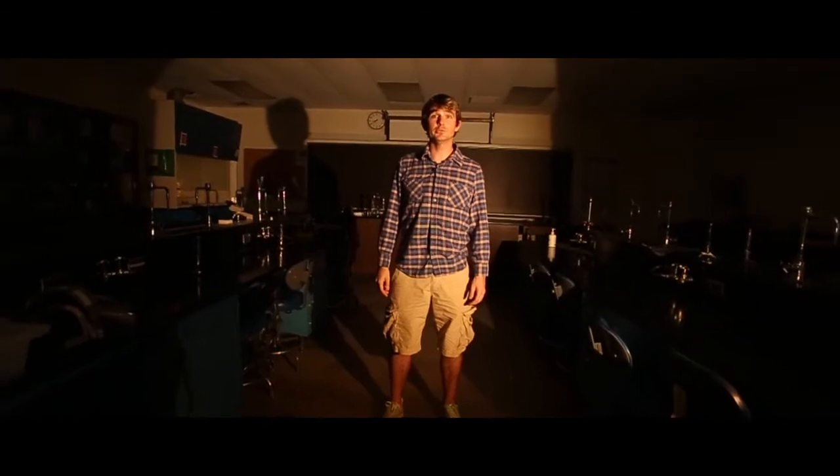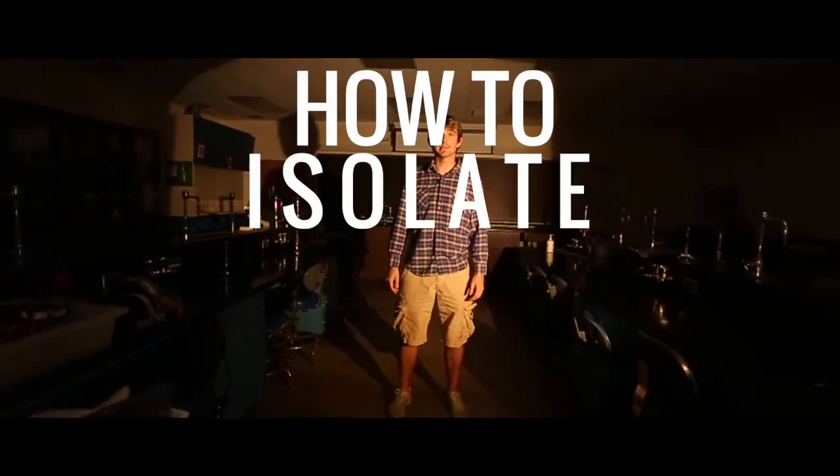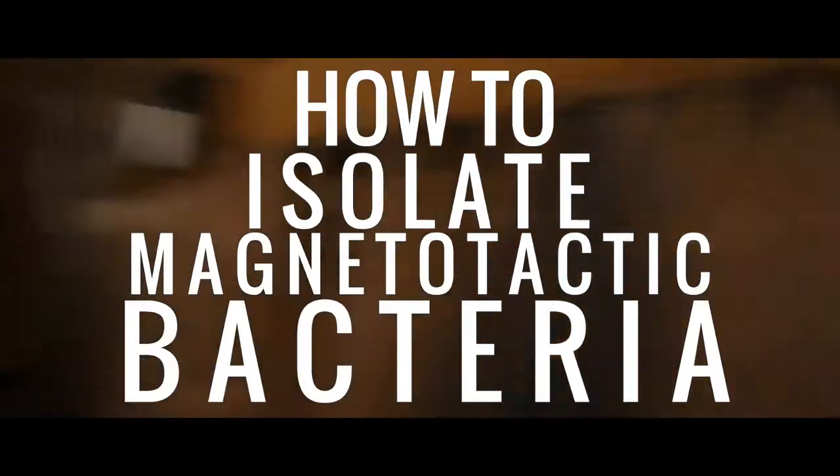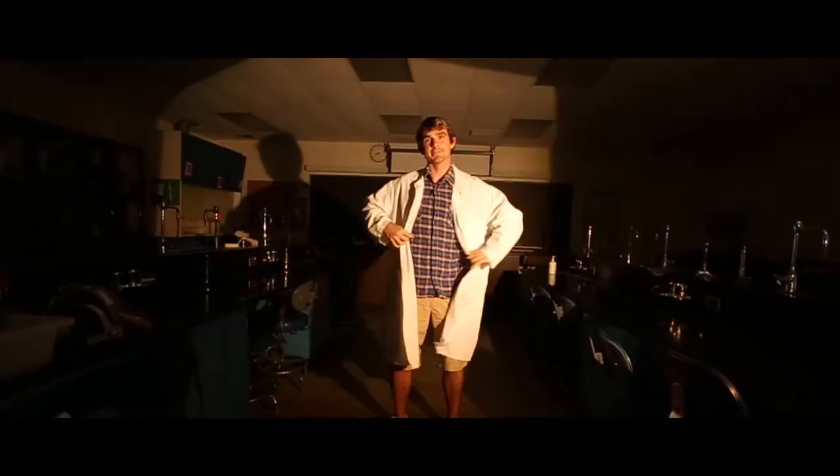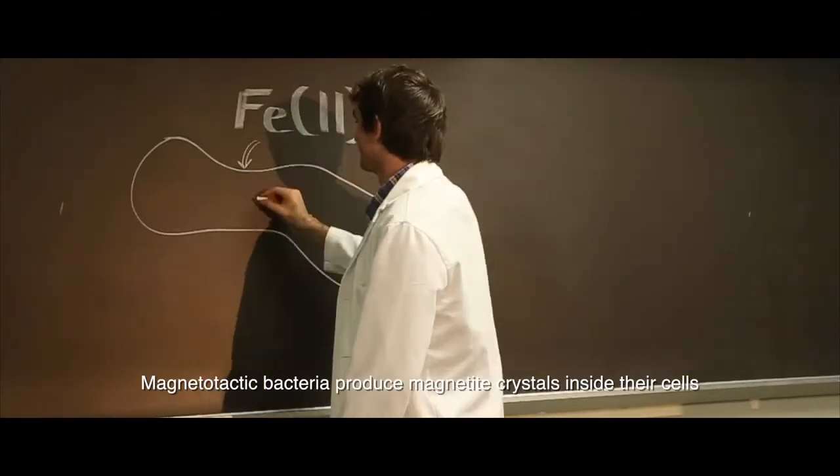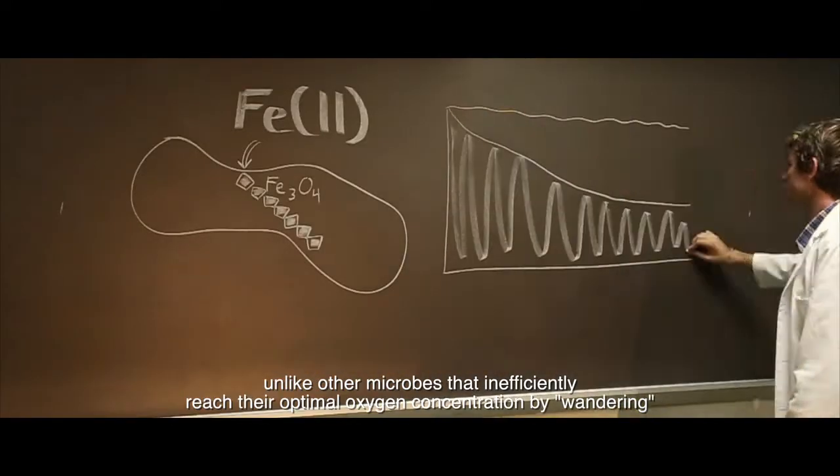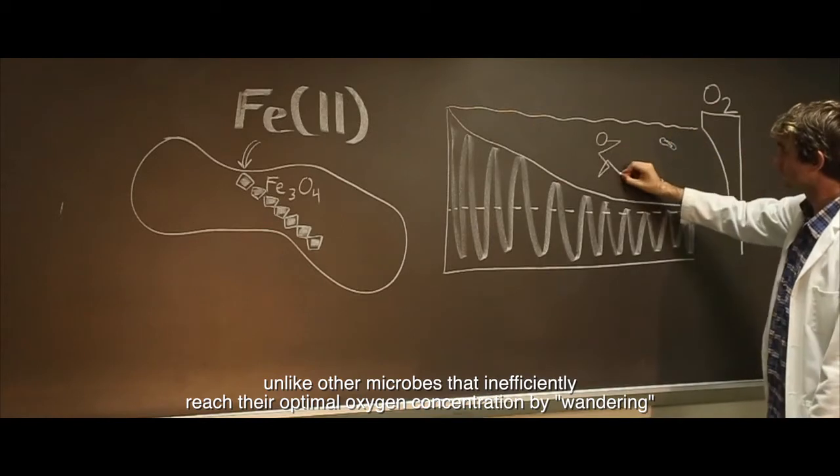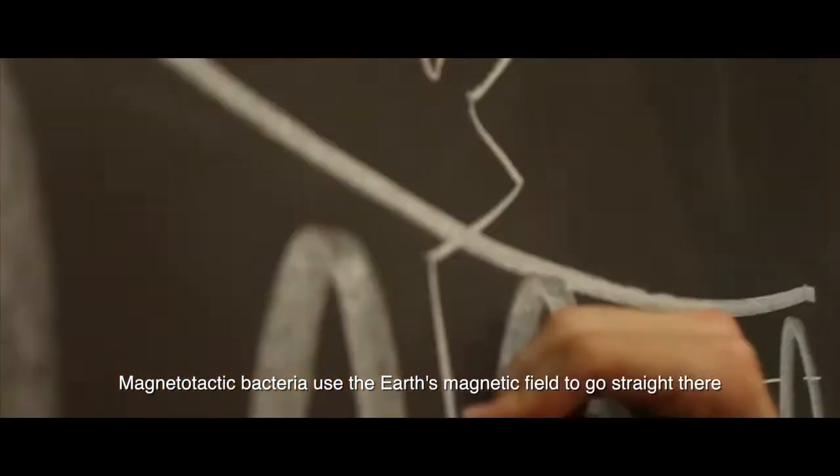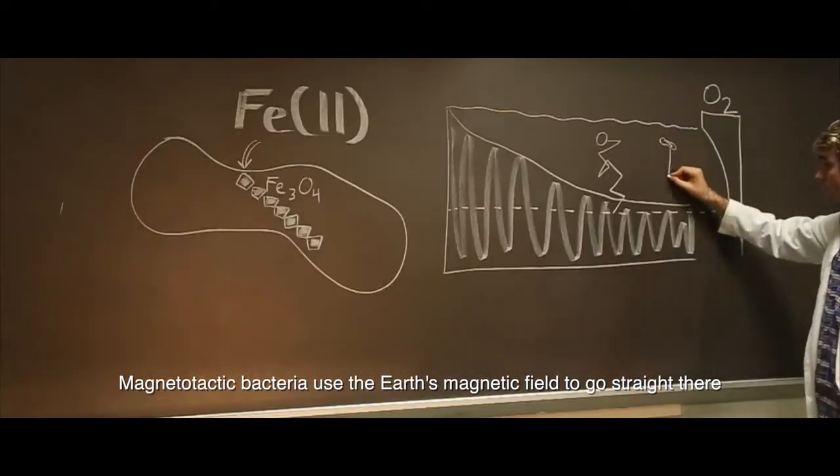Today I'll be taking you through some techniques on how to isolate magnetotactic bacteria. Magnetotactic bacteria produce magnetite crystals inside their cells. Unlike other microbes that inefficiently reach their optimal O2 concentration by wandering, magnetotactic bacteria use Earth's magnetic field to go straight there.